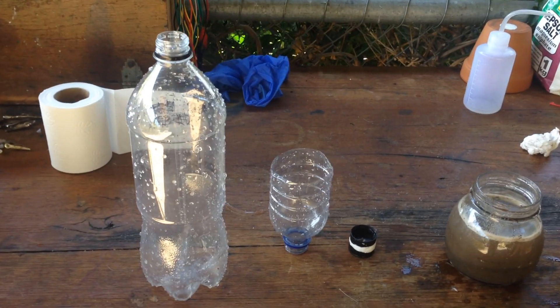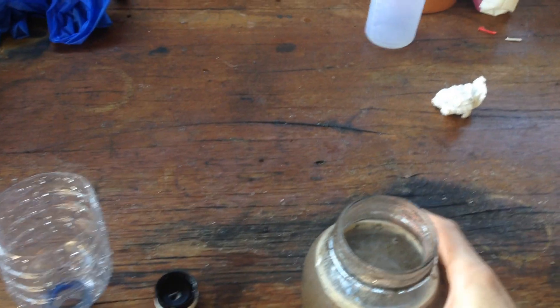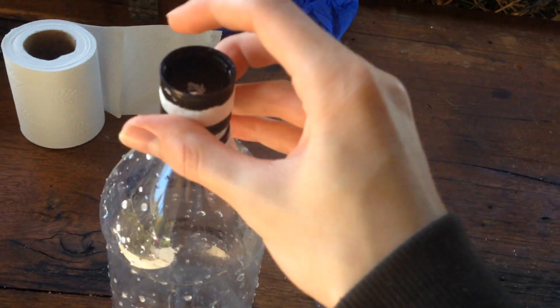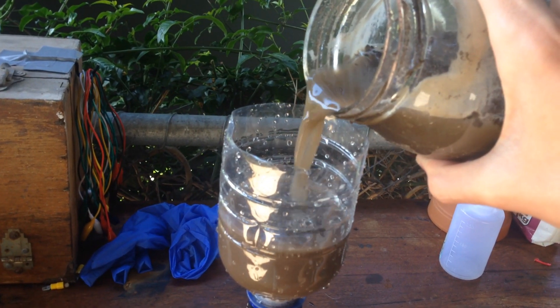So while this vacuum filter works pretty well for that kind of filtration with not many solid particles, what it's really good at is removing solid particles from solutions that have a lot of solid particles — like this. I've just got some water and mixed dirt with it, so we've got a really muddy solution. We want to filter this, so we'll put it back together again and stuff a piece of paper down into the hole in the bottom. We'll use a slightly bigger piece this time, seeing as there are a lot more solids.